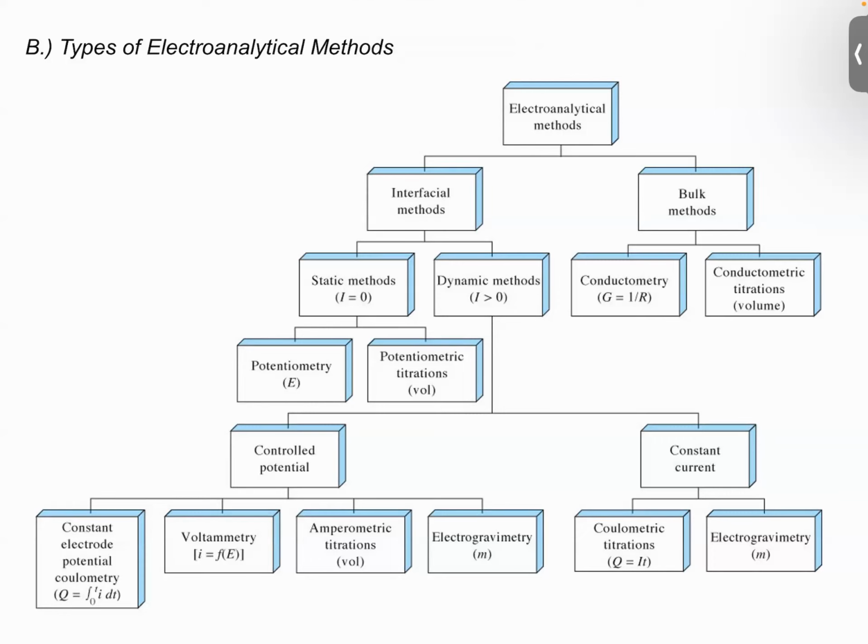Okay. So this is an advanced technique, and hardly being explored in Malaysia. So that's why, if we have at least some knowledge on electrochemistry, you can use electrochemistry not just in biosensor or chemical sensor, but also in other studies, for example, corrosion. That's what comes to my mind, but there are other applications of electrochemical techniques.